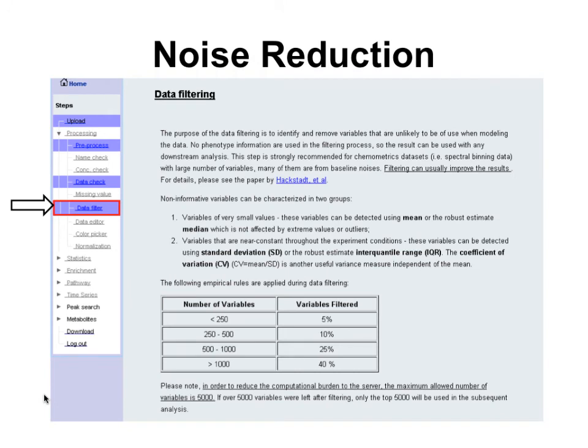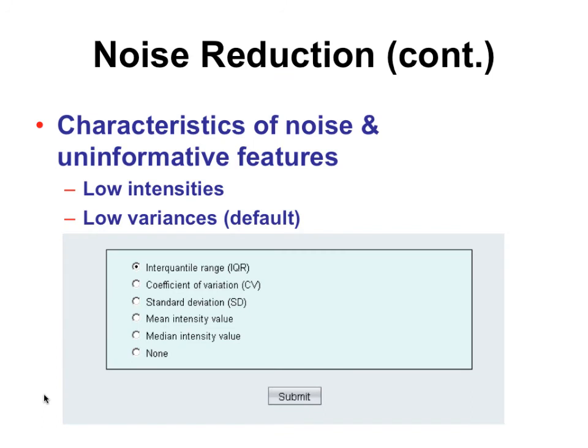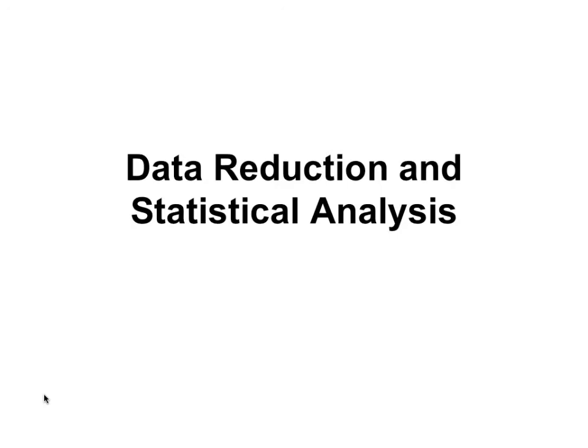There is a data reduction component, a data filtering or noise reduction. We're not going to go into that too much, but it is typical when you have peak lists only. And you can choose which numbers or variables are going to be filtered, how many are going to be removed, what percentage. Usually, when you can identify noisy features, they are typically the things that are at the lowest intensities. Not really certain about them. And those can be cleared out by different choices. We're not going to have to do this with this data set that we're working with, but these are some of the options that are available in MetaboAnalyst.